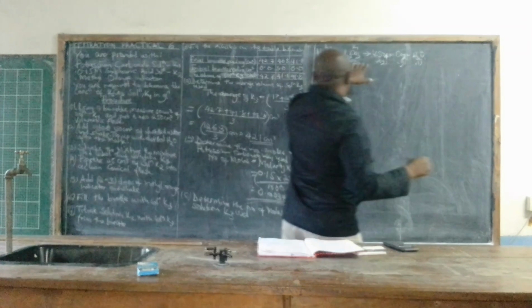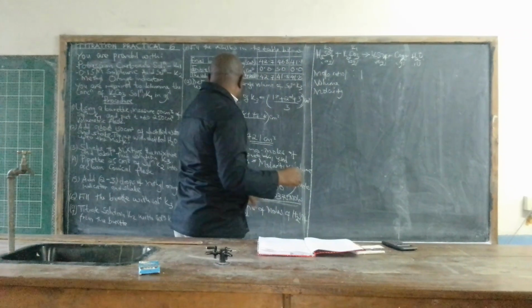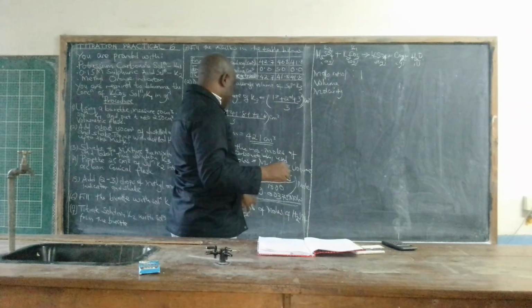So we are going to do this. Because the mole ratio here is the same, and we have found the number of moles of K1 here.